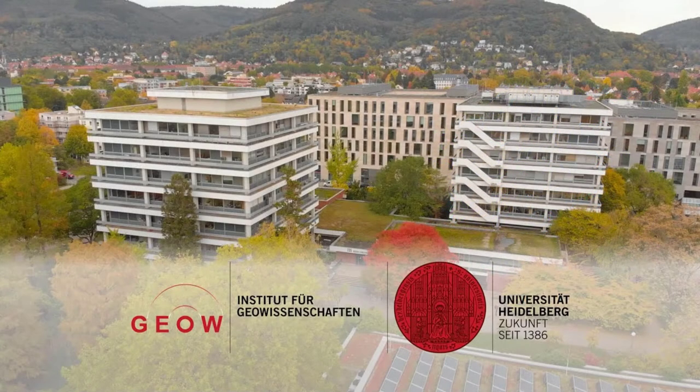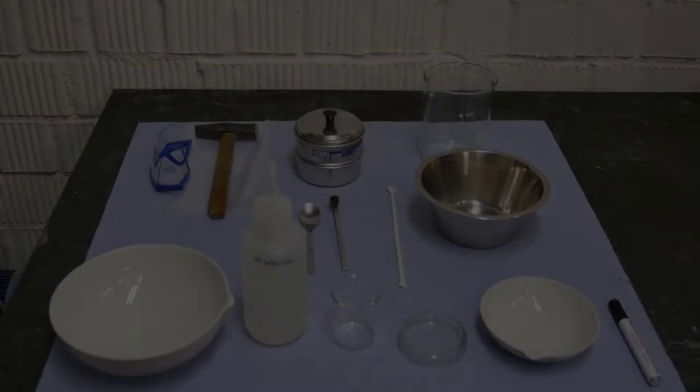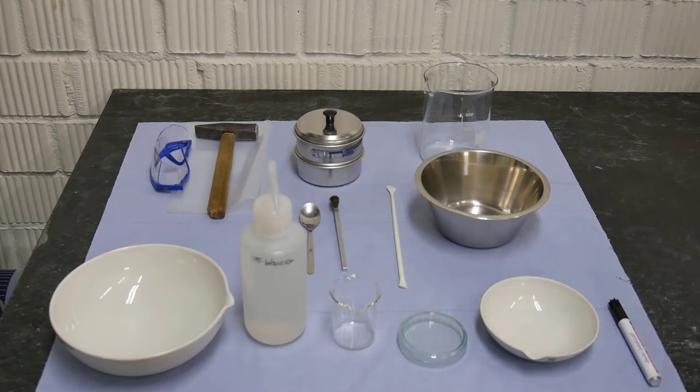In this video tutorial we would like to show you how we separate heavy minerals in the Institute of Geosciences at Heidelberg University. This method involves four different steps: the first step is crushing the rock, the second step is sieving the material, the third step is density separation using water, and the fourth and last step is mineral picking with the help of a binocular microscope. In this video I will show you in detail how to do each of these steps.